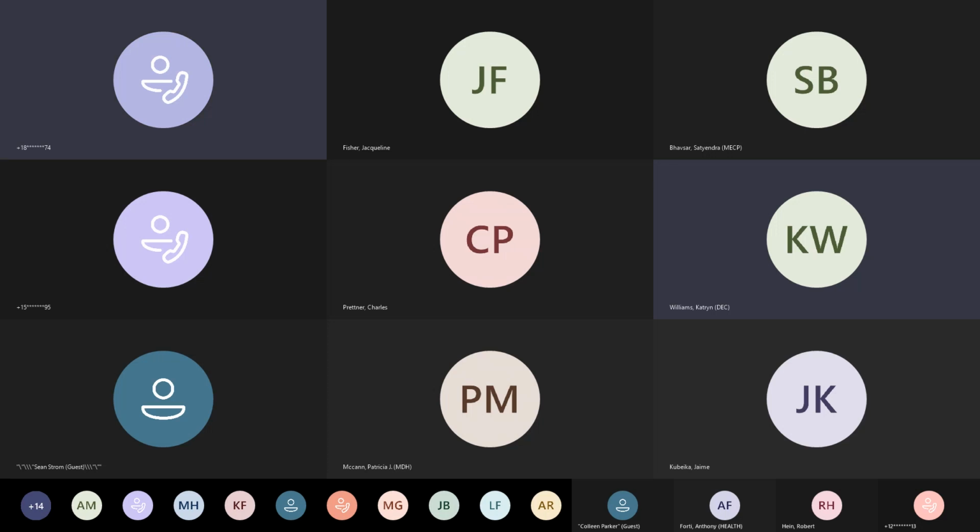Yeah, I appreciate that. It's really hard, because if you're giving folks a very long laundry list of analytes and saying you have to meet this limit for all of these analytes, odds are you're going to have a couple in the world of PFAS that are going to require dilution. Identifying those critical ones with a laboratory up front in the project is probably your best bet, and providing them with some if-then statements on those analytes. That's the best setup for success that I see for a project.